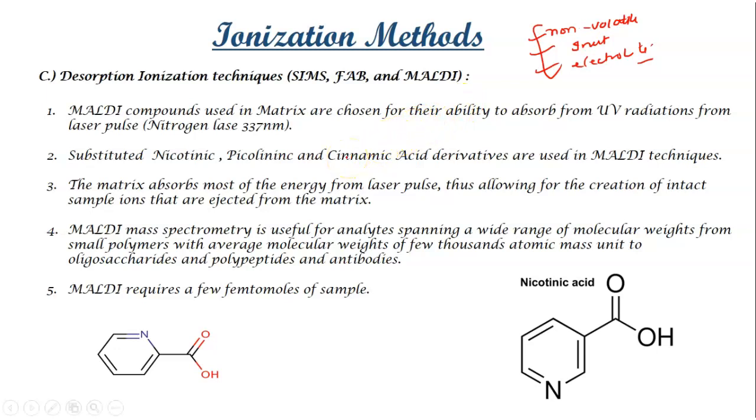Okay, and supposing your matrix is more acidic than the analyte, then predominantly what kind of ions are going to get formed?